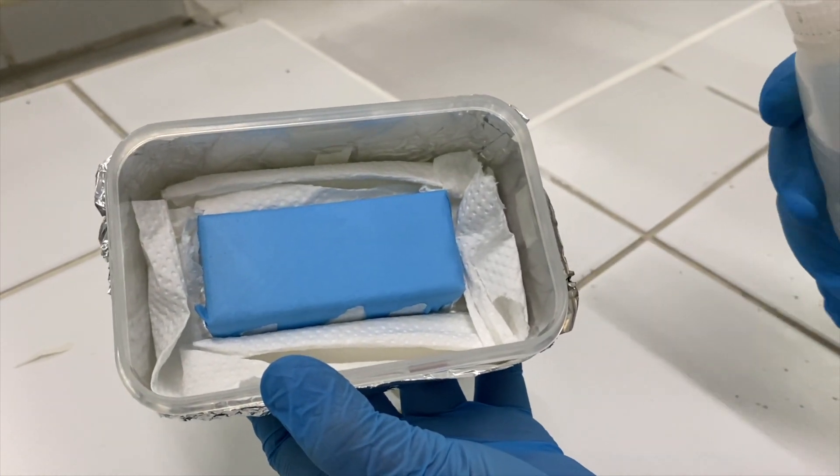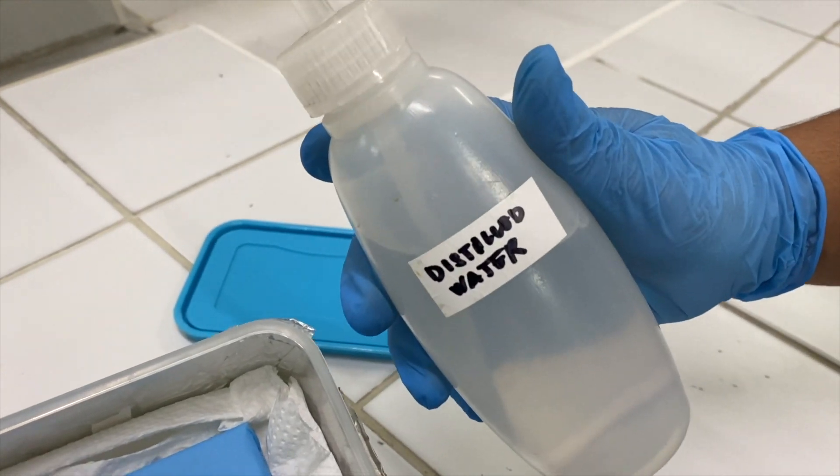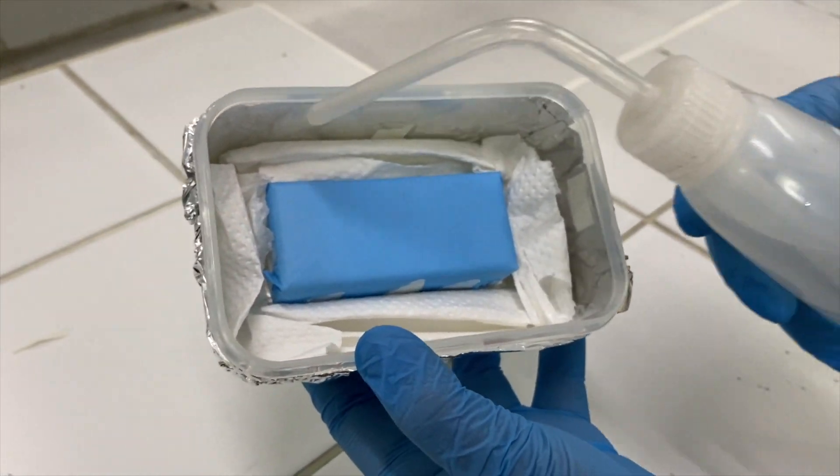Once everything has been assembled, apply distilled water to your paper towels and always keep them moist throughout the entire IHC process.